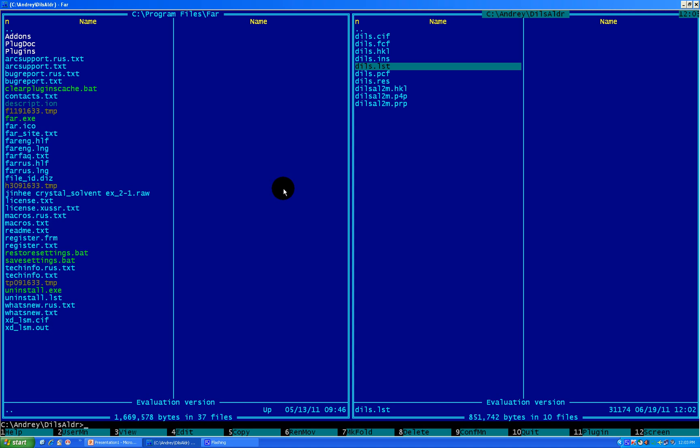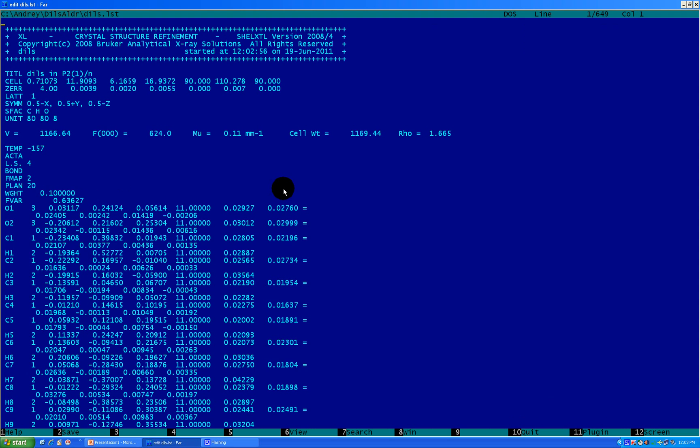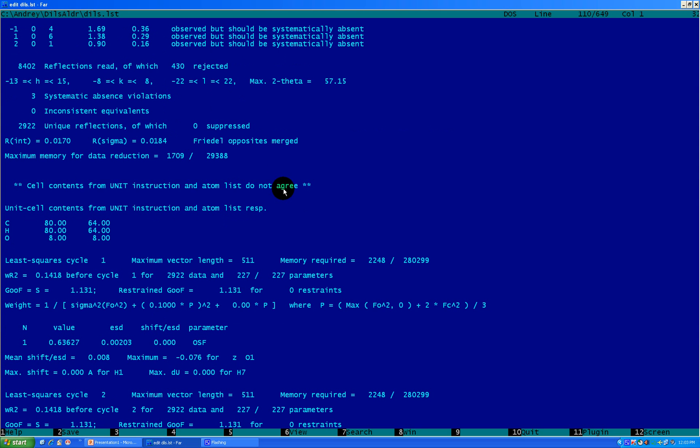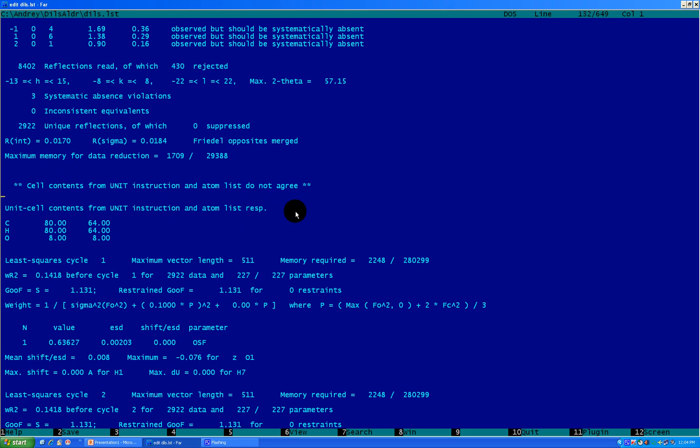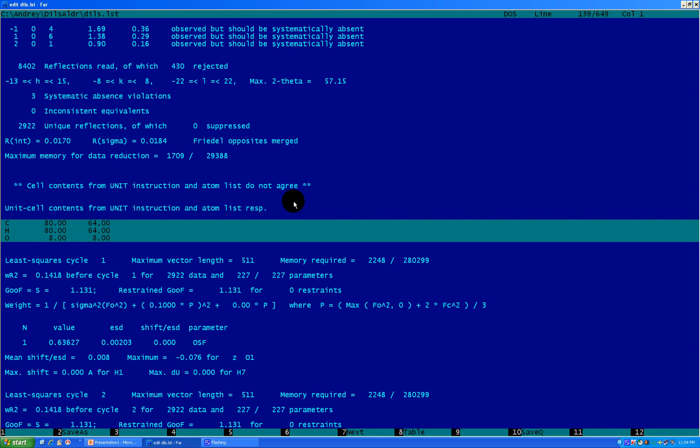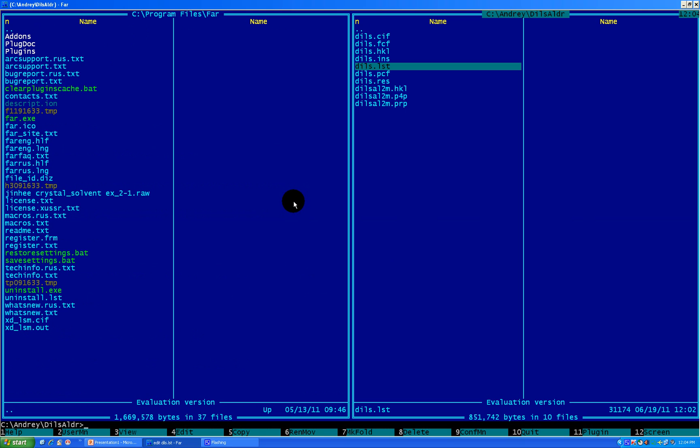Let's go back with Control O. Go to LST file, open it with F4 for editing. And go down, page down, until you see the same error right here. Cell content from unit instruction and atom list do not agree. And you see, here is the table. With shift and arrow down, copy this table. Select this table and press Control C to copy it.